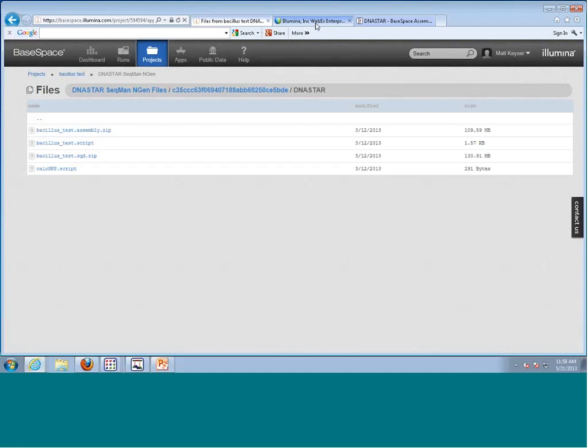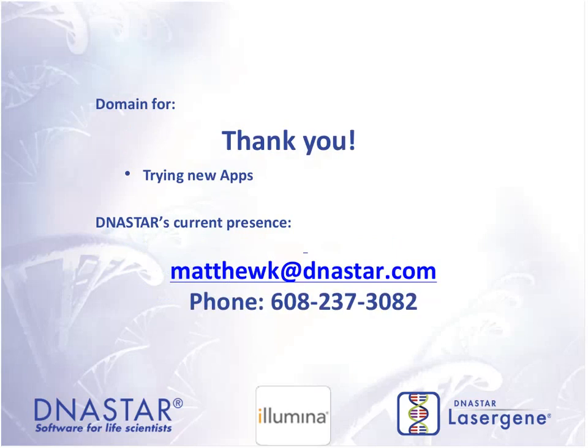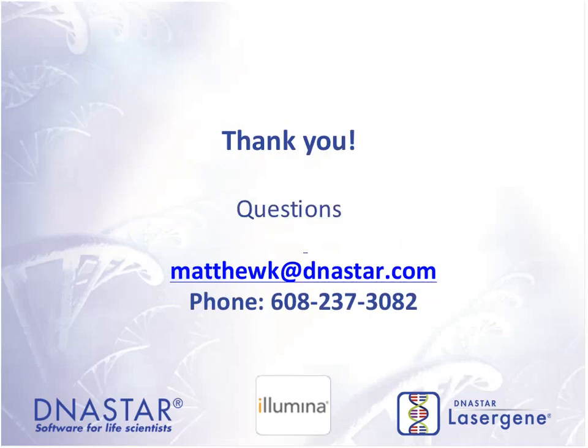And I did show the one parameter, which was minimum match percentage, which really has the greatest impact on your assembly. And so that's the starting point. Depending on what the problem is with the assembly, we may change some other parameters like MER size or other things of that nature. But generally, what I recommend is go with the default parameters. If you want to improve the assembly, utilize our tech support. Give us a call, and we'll help you out and optimize that assembly for you.